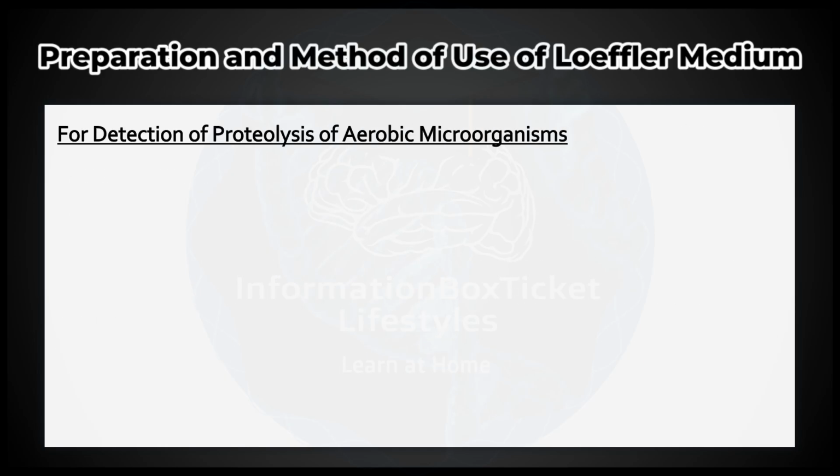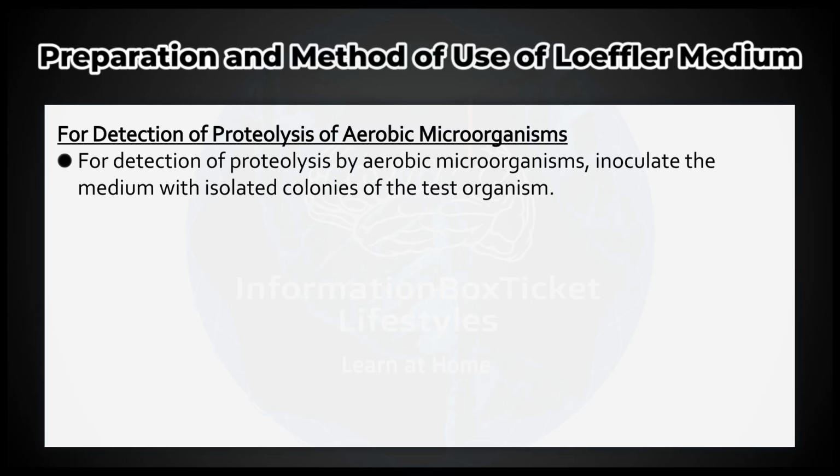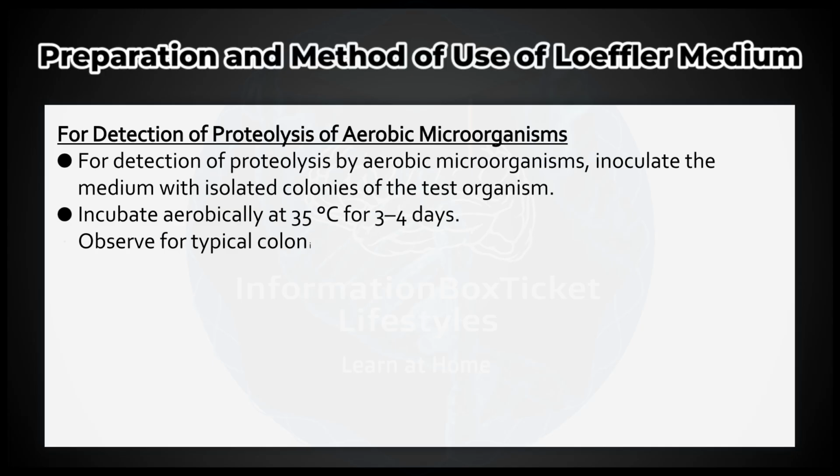For detection of proteolysis by aerobic microorganisms, inoculate the medium with isolated colonies of the test organism. Incubate aerobically at 35 degrees Celsius for 3 to 4 days. Observe for typical colonial morphology and evidence of proteolysis.